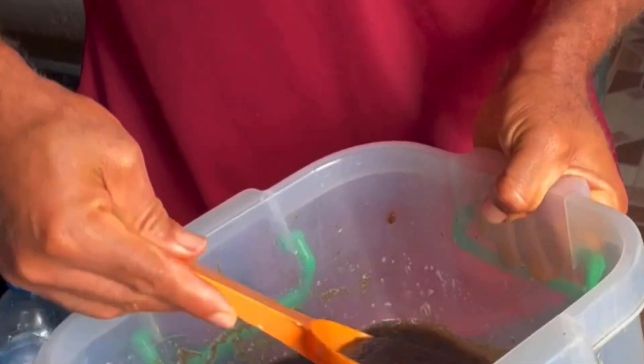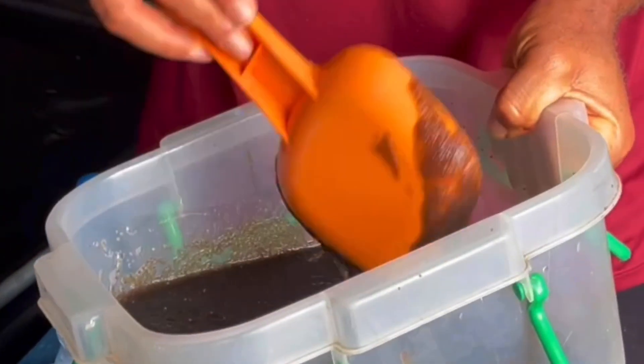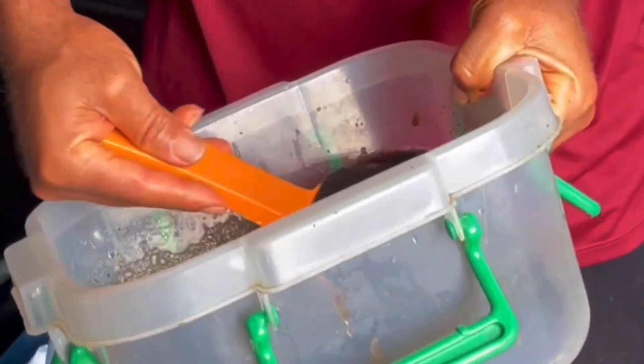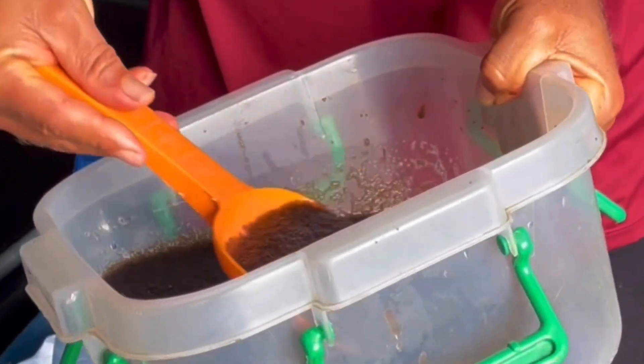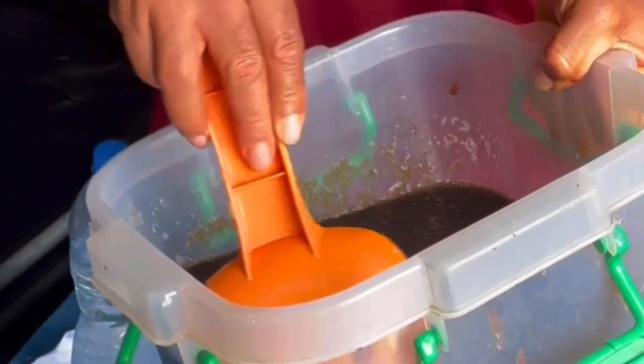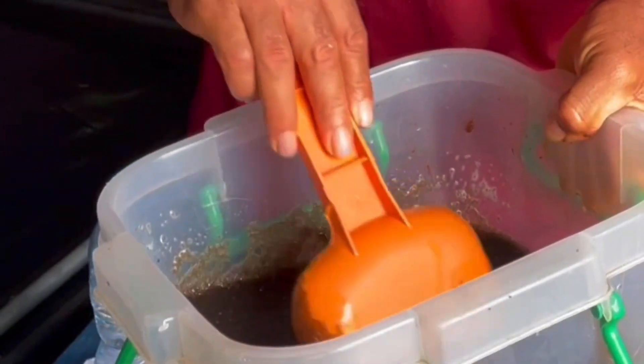It takes just one minute for the eggs to fertilize — just one minute. And it takes just 24 hours, or less depending on the temperature, for this to turn into fish.